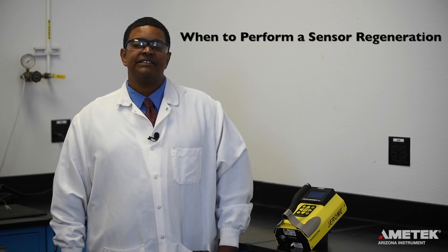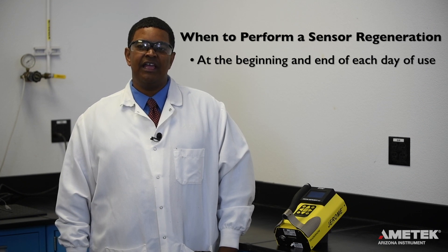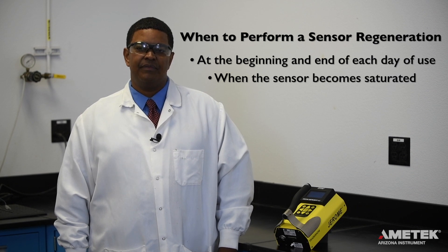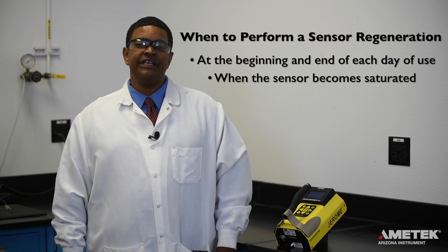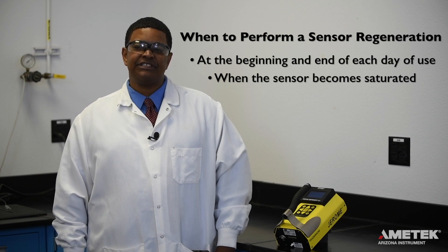Now that the instrument is on, it's time to perform a sensor regeneration. Sensor regeneration should be performed at the beginning and end of every day you are using the instrument, as well as whenever the sensor becomes saturated. Regeneration helps to reset the sensor so that it can continue to provide accurate and precise readings.